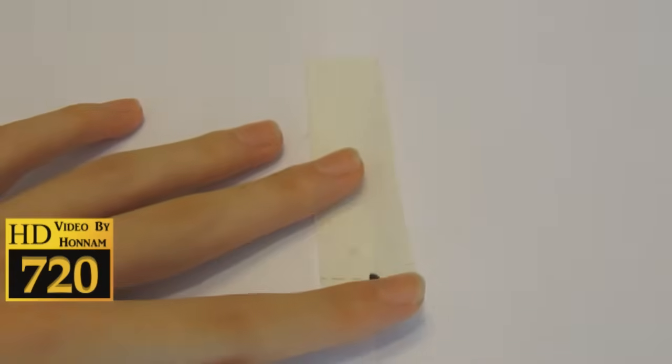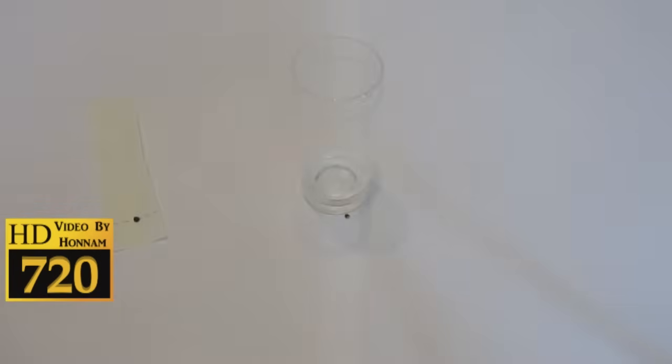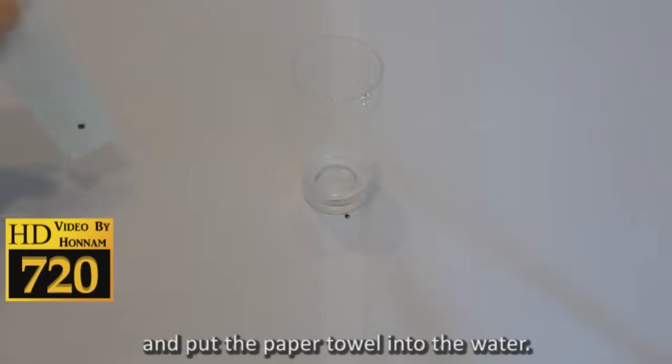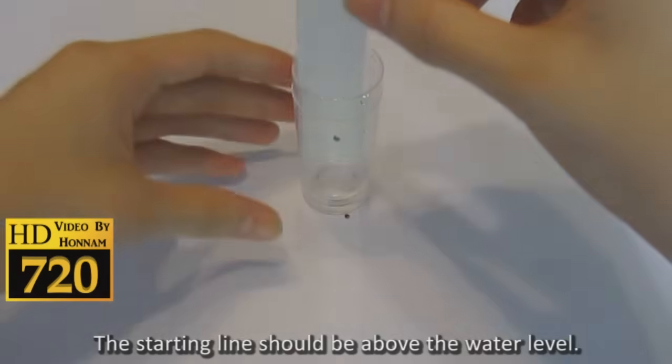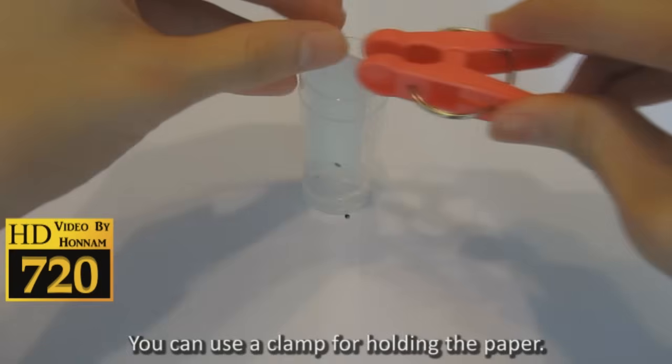Now prepare a tube. Pour some water into it and put the paper towel into the water. The starting line should be above the water level. You can use a clamp for holding the paper.